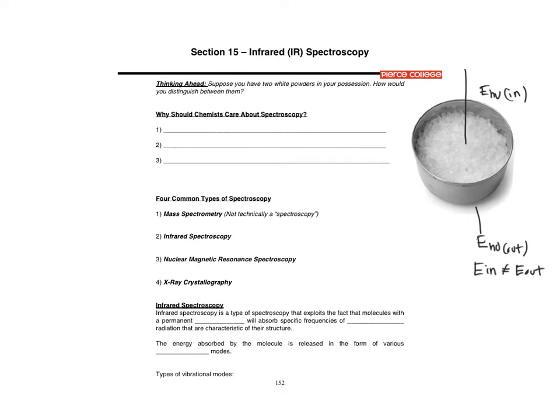All right, so why do we use spectroscopy? It's actually extremely important. So it helps us, as the first question posed, identify an unknown. It can also help us determine the purity of something we know. So we could acquire a spectrum of it, and if it looks like it should, then we can determine purity. So identity, purity, but also as when we move into reactions, we'll see that's a very useful tool to test the progress of a reaction. So if the reaction's not done, we'll see evidence of starting material present as well as product.